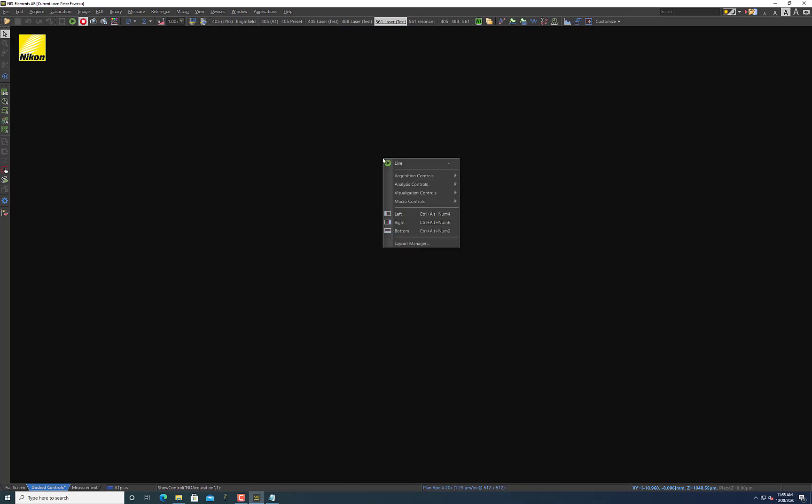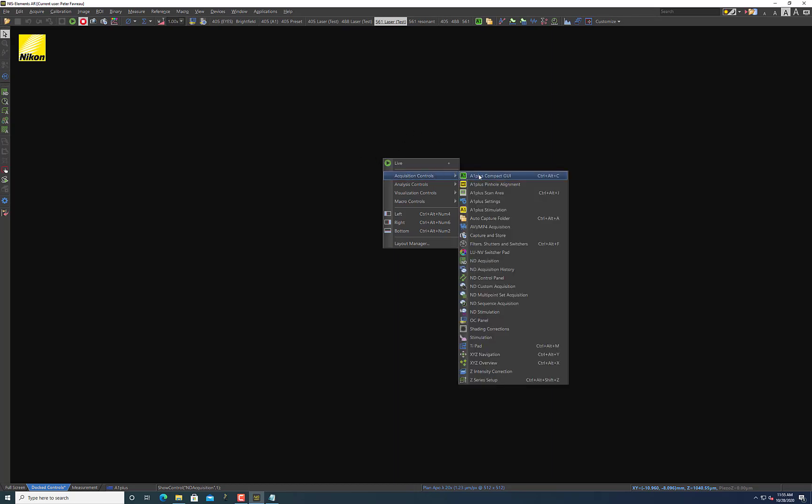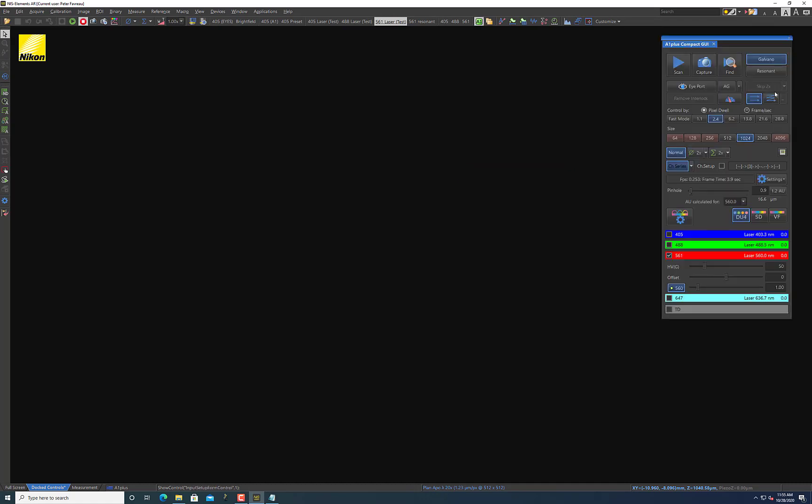So let's start by opening the A1 Plus GUI here in Elements. I'm just going to right-click anywhere, go to A1 Plus Compact GUI right here. I've explained some of the imaging parameters in previous videos, but I'll just show you that right now it's at galvano, which is the normal imaging mode that most people are used to, and I have it set for the 561 laser. My sample is already in focus, and let me just hit play.